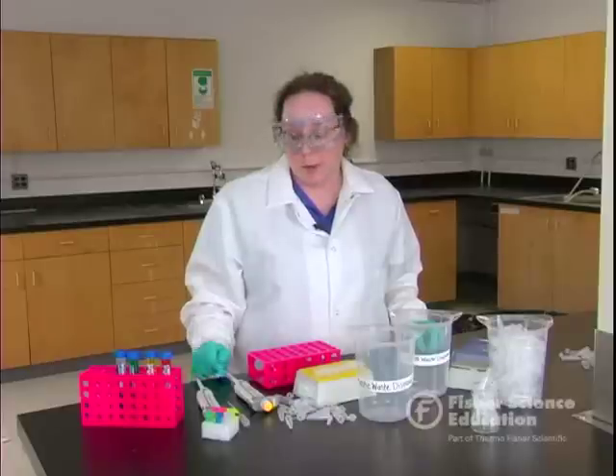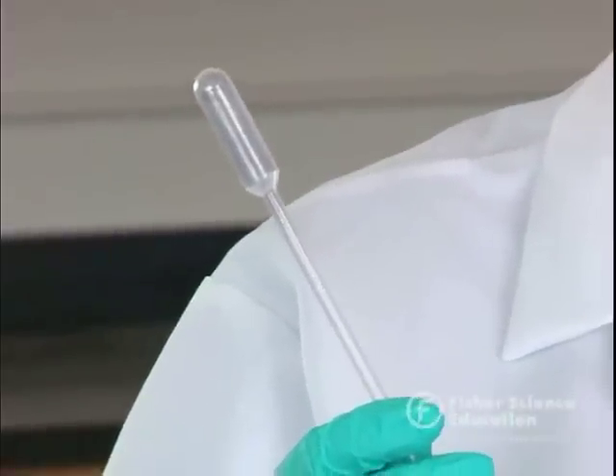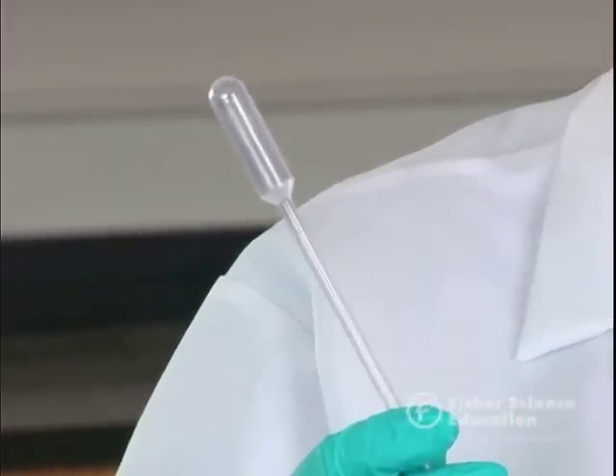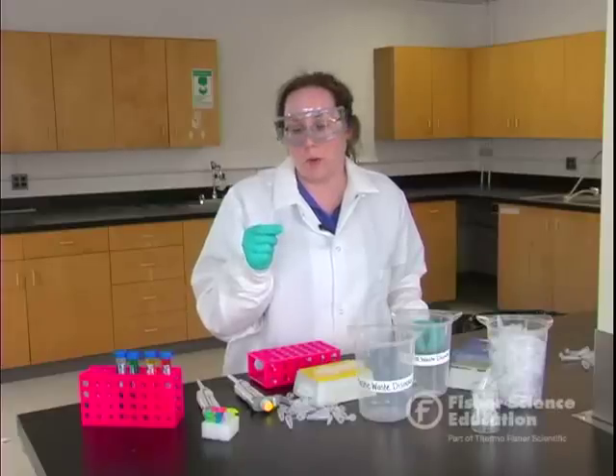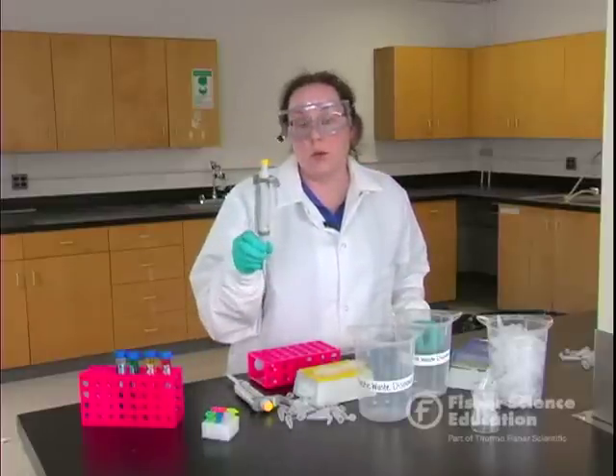Pipettes are commonly used in forensic labs and research labs all over the world, and with just a few simple techniques you can help increase your accuracy and make it a better tool for your students — especially those who want to go into research or forensic science. Most students, when I talk about a pipette, think of the basic one used in biology. We want to toss that one out the window and get them using some really cool pipetters.